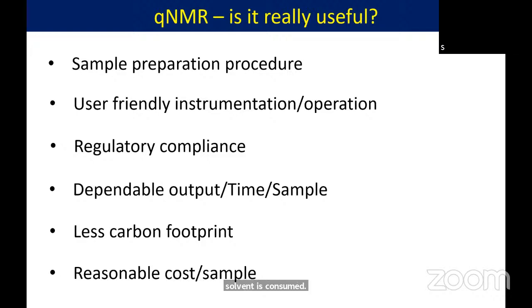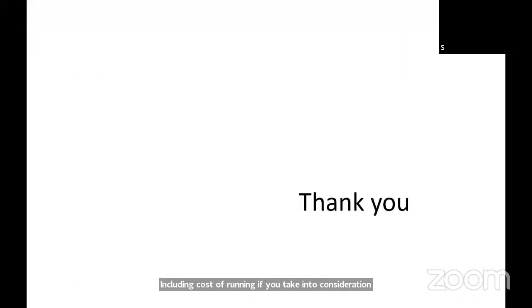Cost per sample. Once the method is developed, for method development, we may have to run many samples. Just now you have seen how many samples we are running, how many times we are running. That may appear costly, but once the method is developed, for running the samples, including cost of running, it will not go beyond 1,000 rupees.